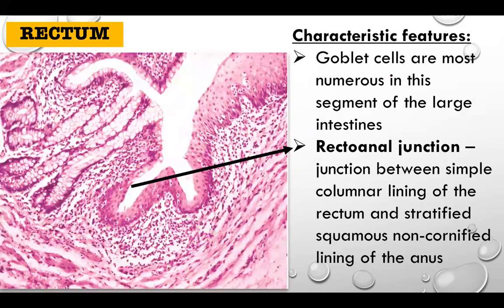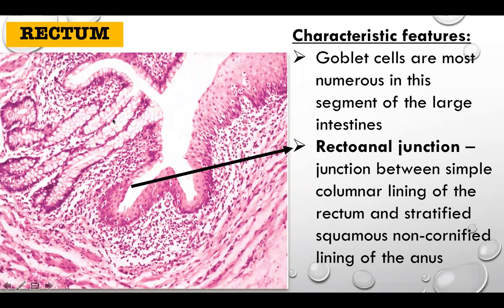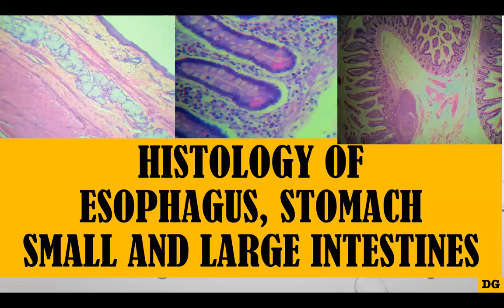In the distal portion of the large intestine — the rectum — goblet cells are the most numerous. This is the recto-anal junction, where the lining epithelium changes from simple columnar with goblet cells of the rectum to stratified squamous non-cornified epithelium of the anus. This is analogous to the squamous columnar junction seen at the gastroesophageal junction. That concludes the histology of esophagus, stomach, small and large intestines.